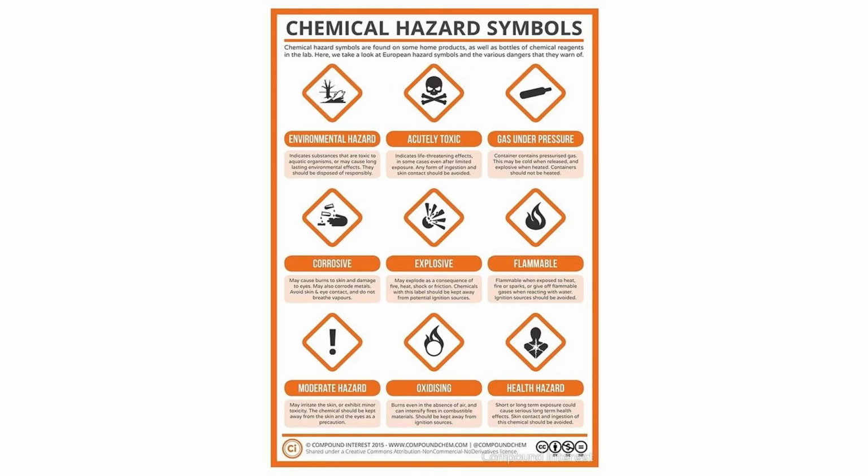You also need to familiarize the different chemical hazard symbols. In this way, it will be easier for you to identify what type of hazard that might be. So make sure you remember the photos. This might go out in the examination, the photos only. Then you're asked to identify what are these photos. So these are the chemical hazard symbols.